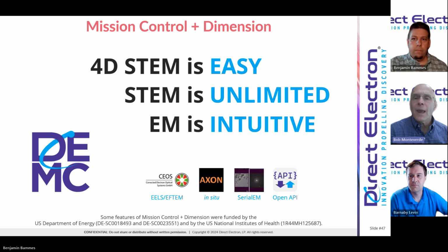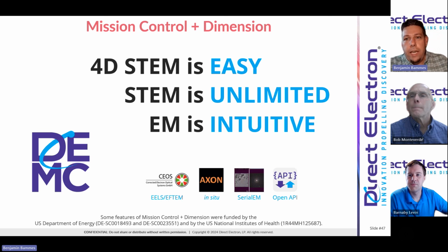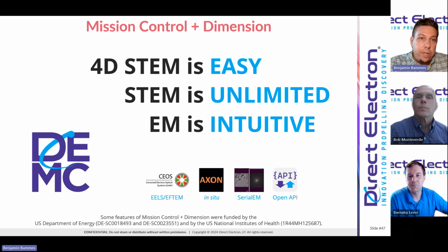Another question came in. The gain target value is related to the specific imaging condition. How to choose that? Yeah, so the gain target value in the green region is essentially the region in which we can get a reliable gain reference. Our cameras are linear in response over that range, so the same gain reference should be applicable across that range.